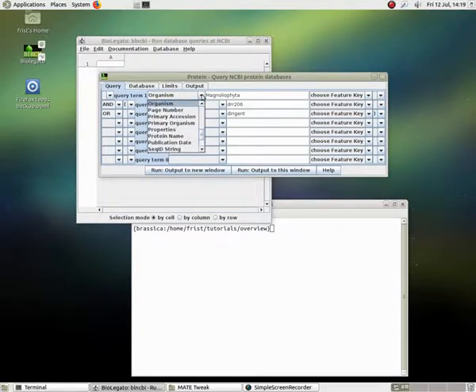we can set query terms, like for example, if I want to find proteins of this type in the flowering plants, I can set the organism field to Magnoliophyta, and then add an AND clause so that we can have two search terms in parentheses, either the text word matches DRR206 or the text word matches dirigent, and I have parentheses that I can put around the expressions to make sure they're evaluated properly.